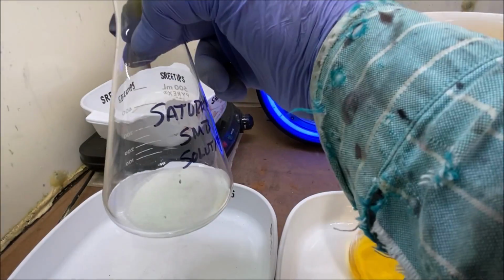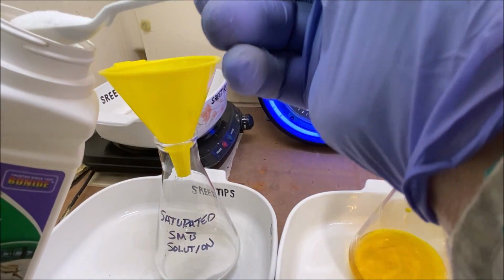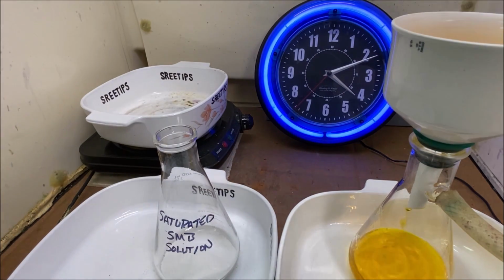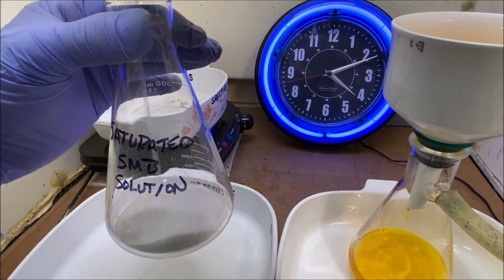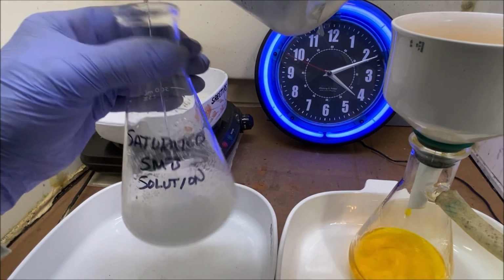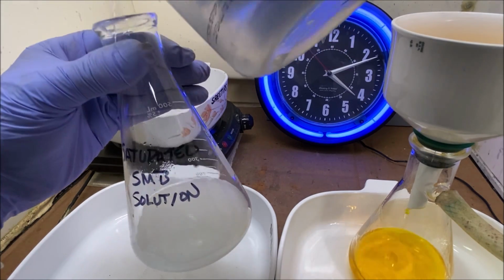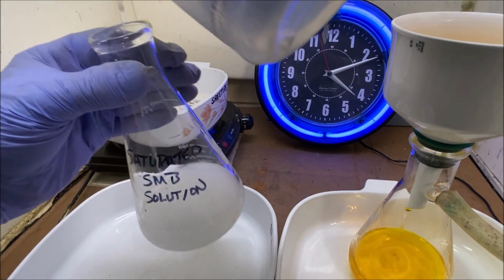Okay, I've added some SMB to a flask. Now what we're going to do is add some distilled water to this and make a saturated solution of sodium metabisulfite. Might have to add a little heat to get all this to dissolve completely.